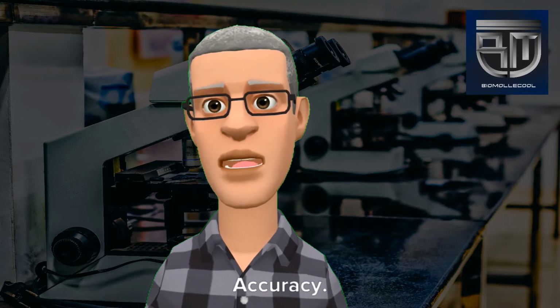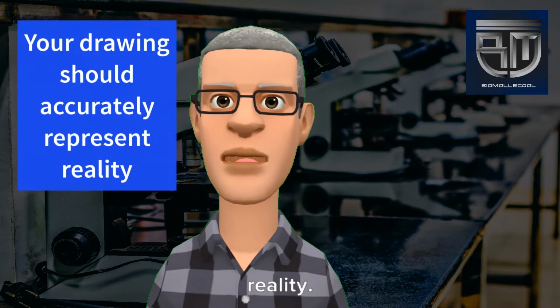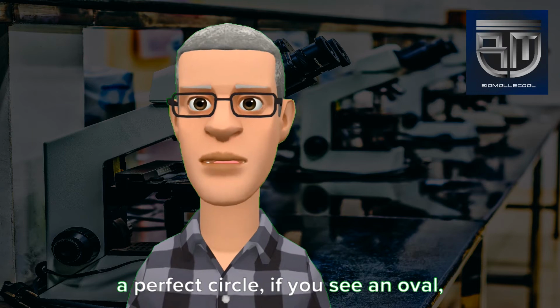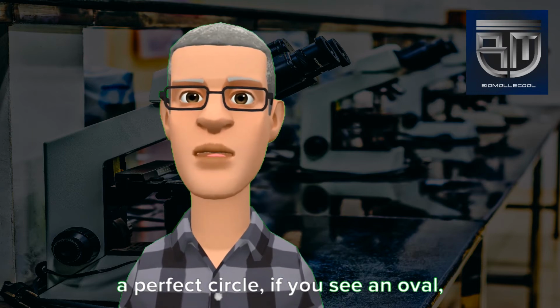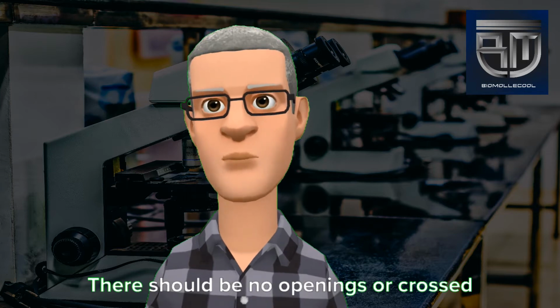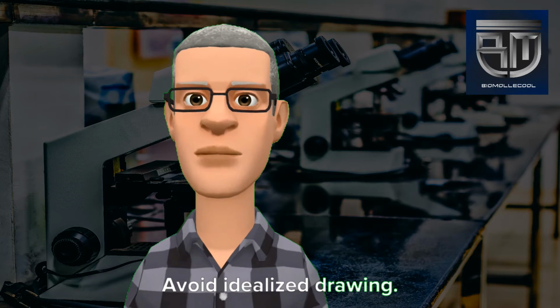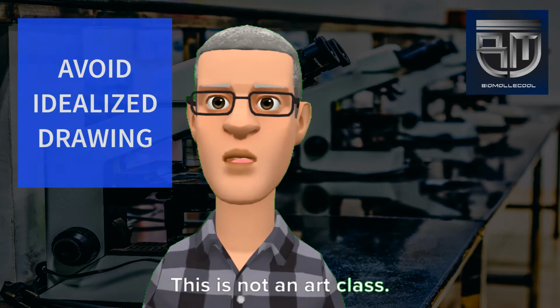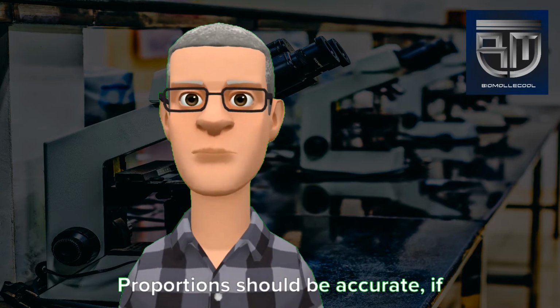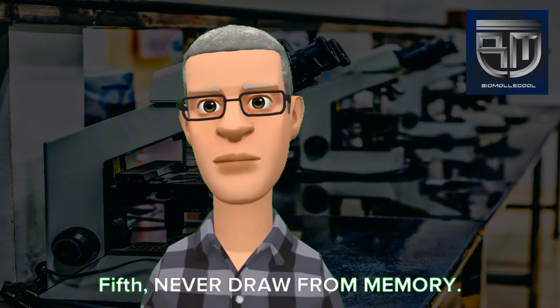Next, number 4, accuracy. Your drawing should accurately represent reality. If you see a perfect circle, draw a perfect circle. If you see an oval, draw an oval. There should be no openings or crossed lines in your drawing. Avoid idealized drawing. This is not an art class. Proportions should be accurate. If necessary, measure length.